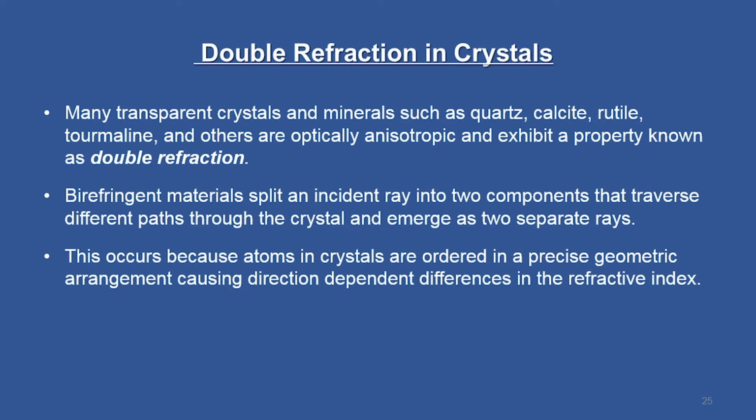The extraordinary ray will not obey this optical rule. That is the difference between an ordinary ray and an extraordinary ray, and we will see how these two rays and their amplitudes are manipulated to obtain a better contrast in this microscope.